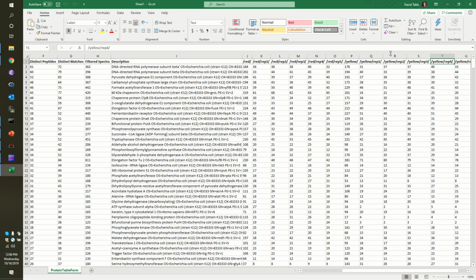So for now, we're going to sign off from this demo and take a little break, because I think we're all yawning a little bit. At least my eyes are running. And we'll come back in a minute to look at doing the same operation, this time handing off MSFragger results to Philosopher.